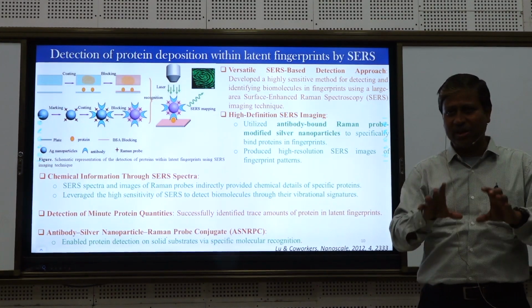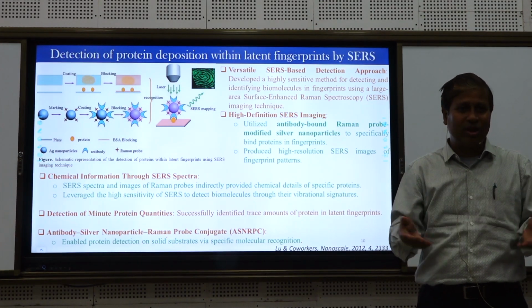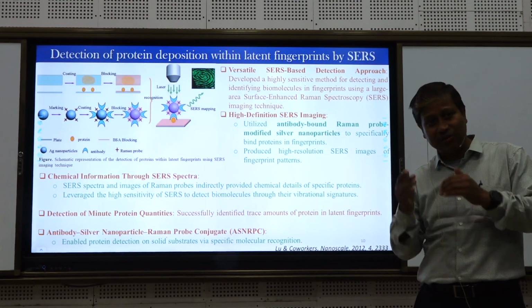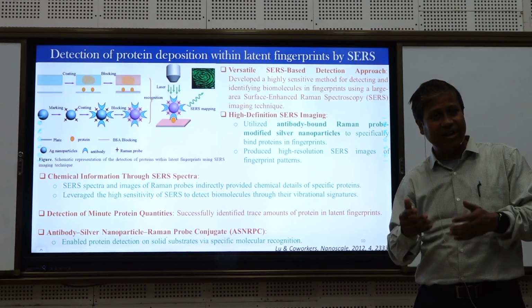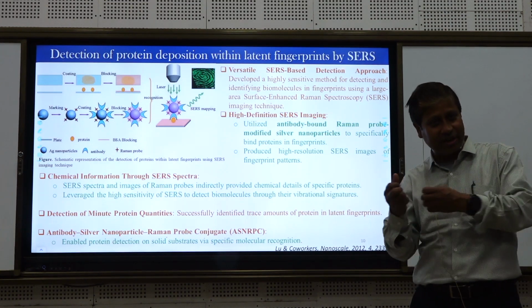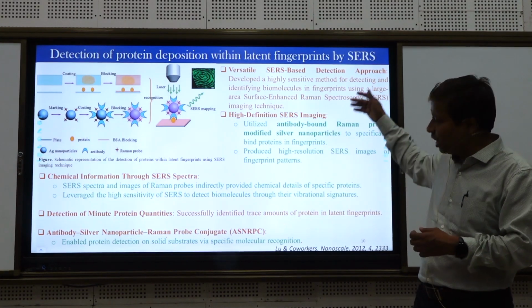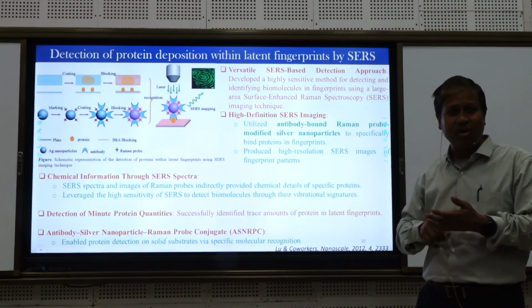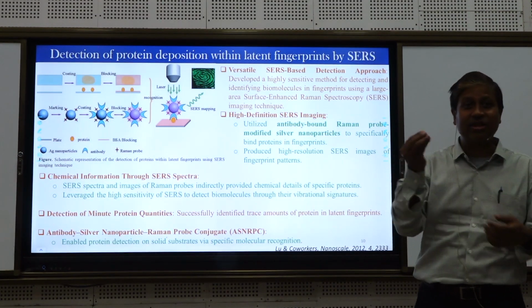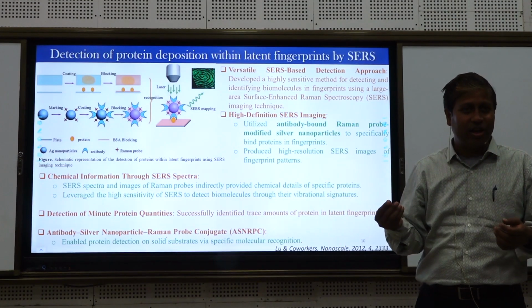In many cases you will see that the spectrum change is so small that apparently you feel there is no change. So those groups devote themselves to finding some numerical method to get data from that. There are many numerical and statistical methods, because in forensic or medicinal work, you cannot just publish that this is a cancerous cell because of one or two studies.